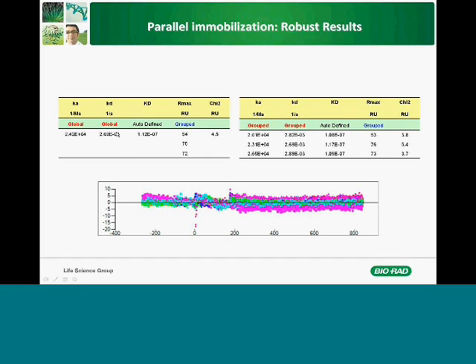And on the right, we told the algorithm to find for each surface an independent fit. I mean, they are independent, they don't see each other. And you can see that the results for the grouped analysis for all surfaces are similar, but also similar to the global analysis. And this indicates that these are two independent analysis sessions, and it's another indication of the quality of the results, that the results are good and you can trust them.